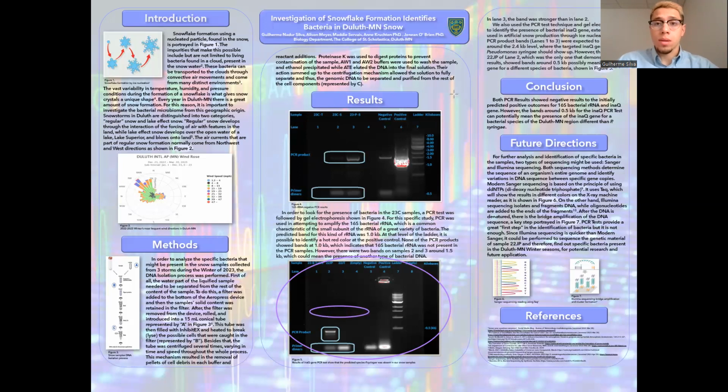We didn't find that, but this time we found PCR products here for one of our lanes. For both of the tests, those first three lanes here, I'll circle them, indicate the lanes in which our samples were inserted in the gel for the PCR test. So they are the most important ones.